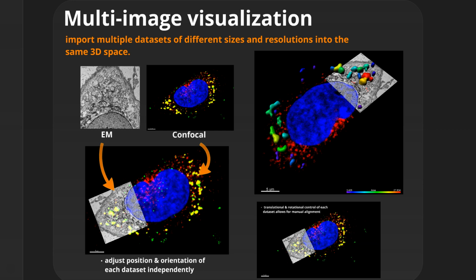So this one, I don't think it was given enough marketing attention because I use it all the time. I even use it when I'm comparing images that have been processed versus not processed, so deconvolved versus non-deconvolved, or if you've applied some kind of processing to it. It's nice to be able to import multiple images.